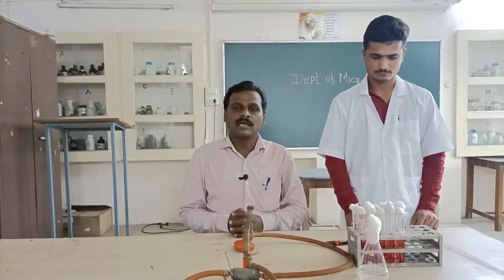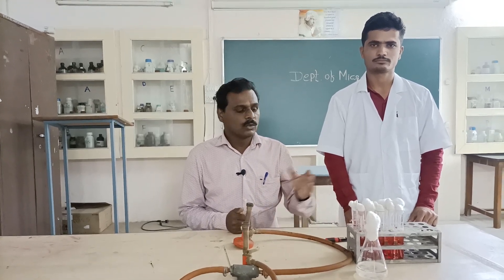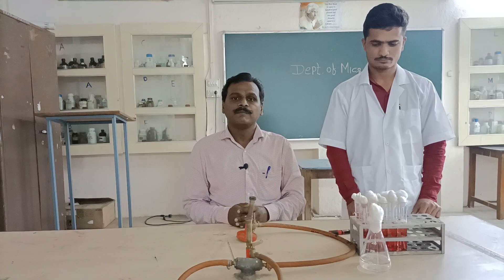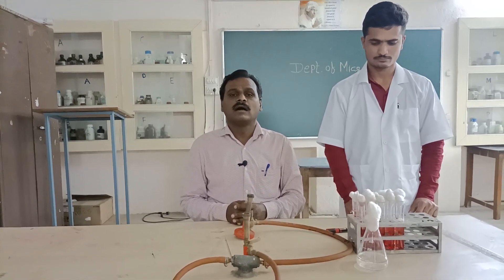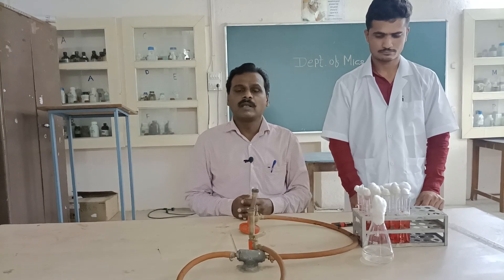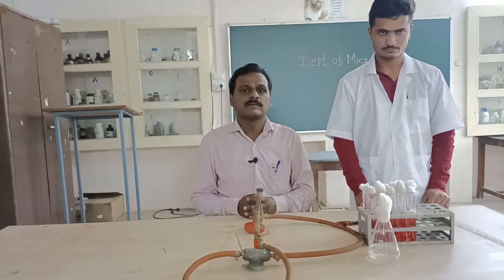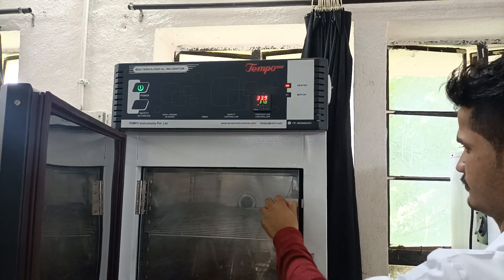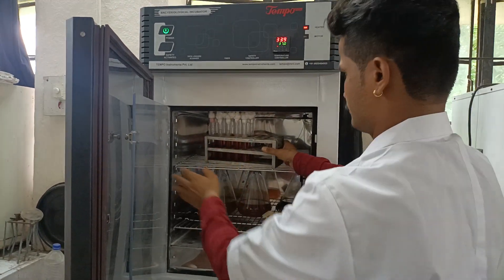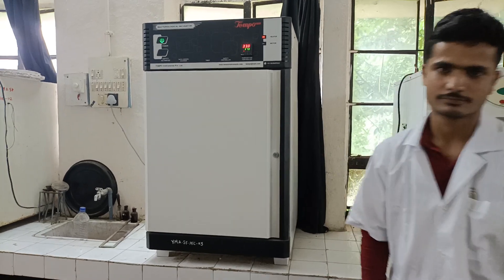This method is used to detect and enumerate coliform and fecal coliform present in the given water sample. Coliform bacteria such as E. coli will ferment lactose sugar and produce acid, indicated by a color change in the medium, and gas, indicated by bubble formation in the Durham's tubes. All tubes are kept for incubation at 37 degrees Celsius for 24 hours.